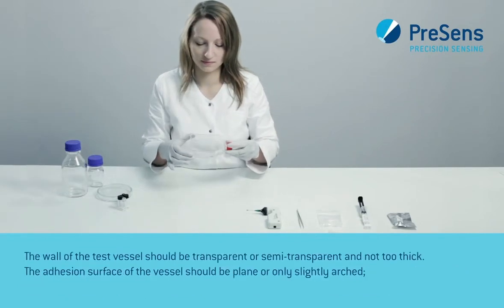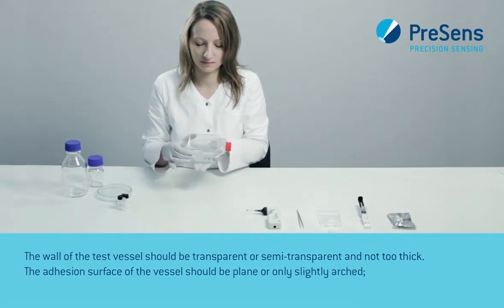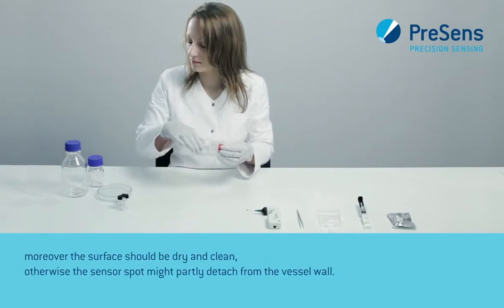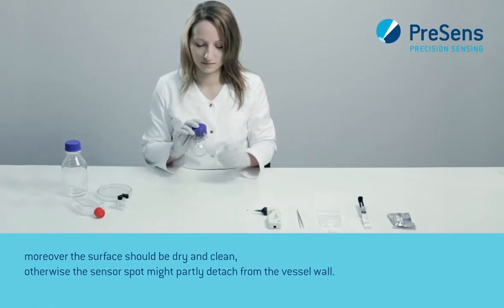The wall of the test vessel should be transparent or semi-transparent and not too thick. The adhesion surface of the vessel should be plain or only slightly arched. Moreover, the surface should be dry and clean, otherwise the sensor spot might partly detach from the vessel wall.